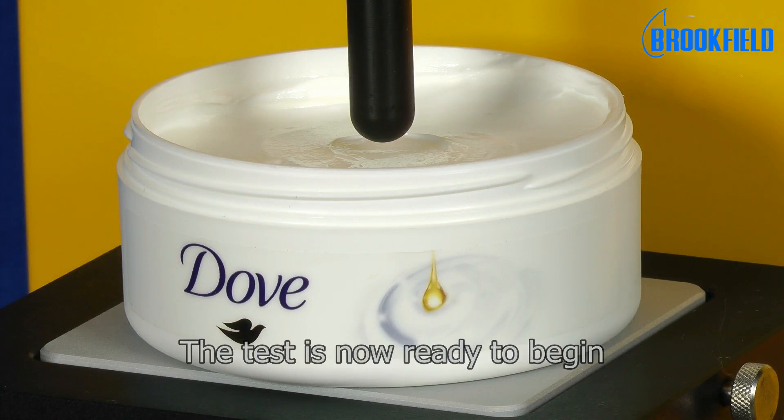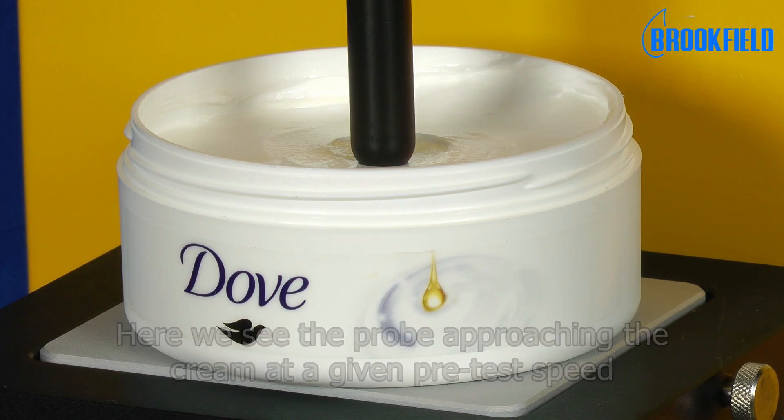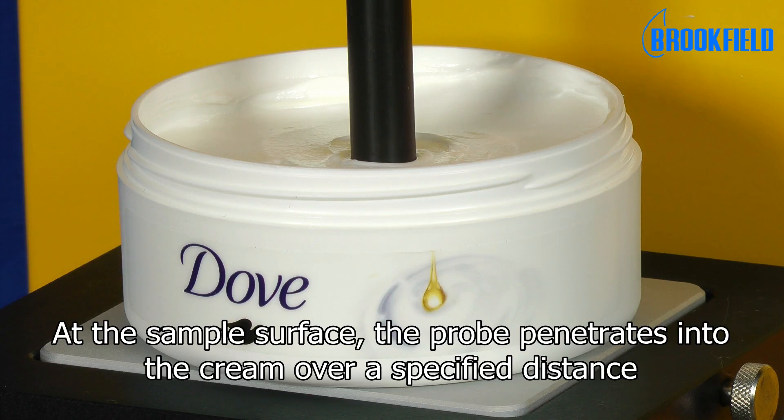The test is now ready to begin. Here we see the probe approaching the cream at a given pre-test speed. At the sample surface, the probe penetrates into the cream over a specified distance.